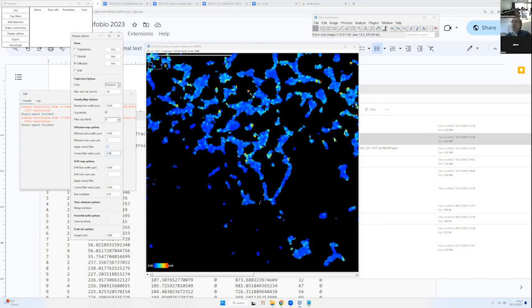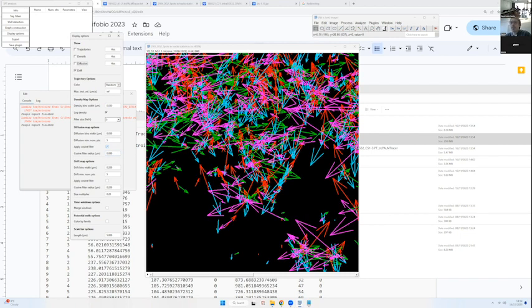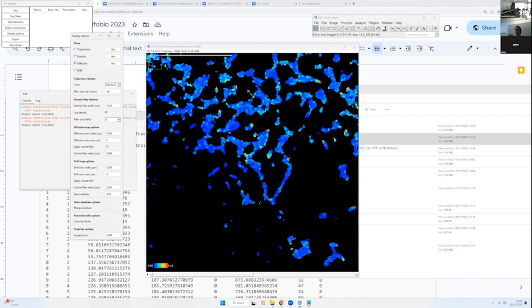Okay, moving on to the last option, the last map. So now this is the drift. I can wait. I saw that in the note. So you have one second. Yes. So you have this. So basically now you see that you can have a much refined, and then we can estimate actually how what's the resolution of this. And so now much higher resolution in terms of how the diffusion. Yeah. Okay. So you have it. Good. Okay.